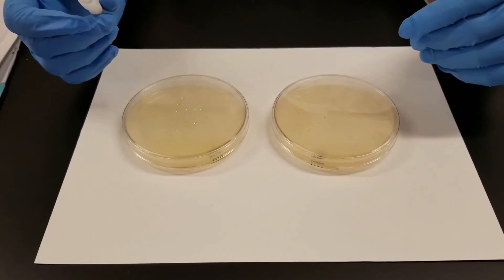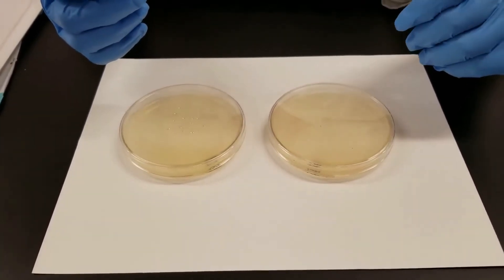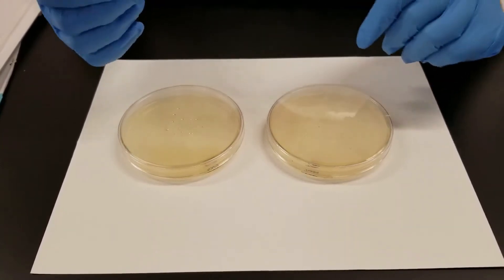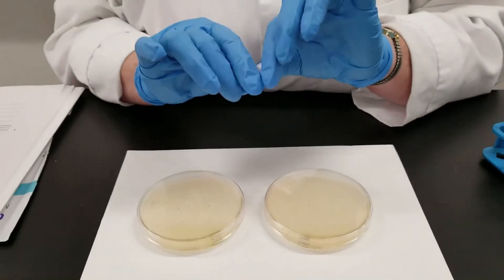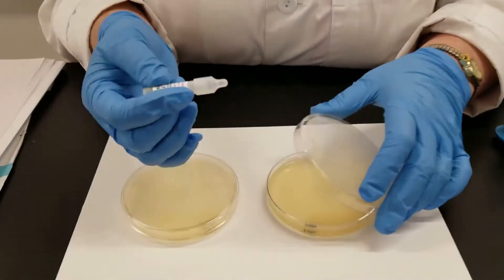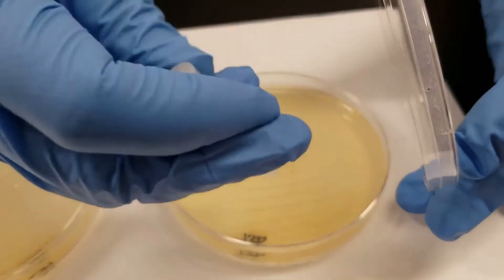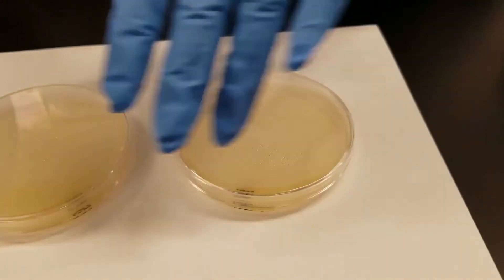This is the oxidase test. Sometimes they will tell you to take a sample and spread it on a slide, but you can do it on the plate. You use the oxidase reagent. This is one of those where you've got the glass ampoule. We're going to break it, and then you add a few drops just directly onto the area where there is growth on both of these plates.